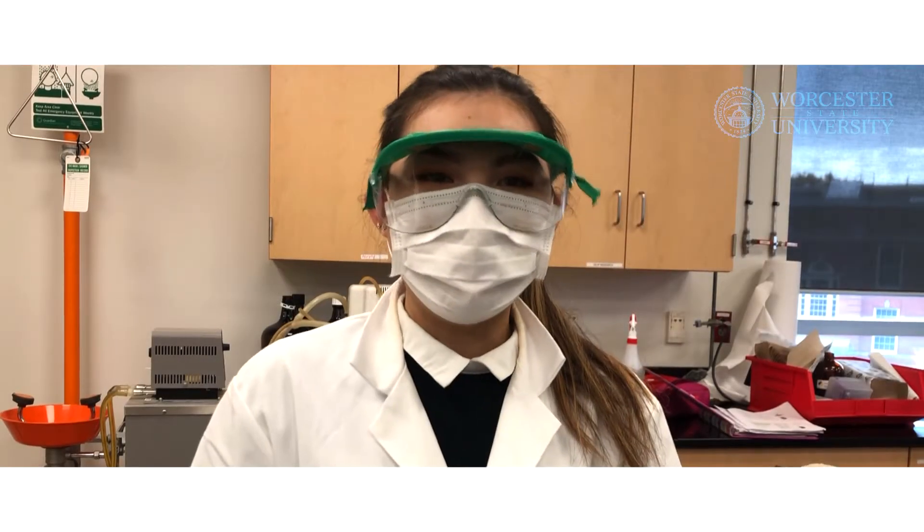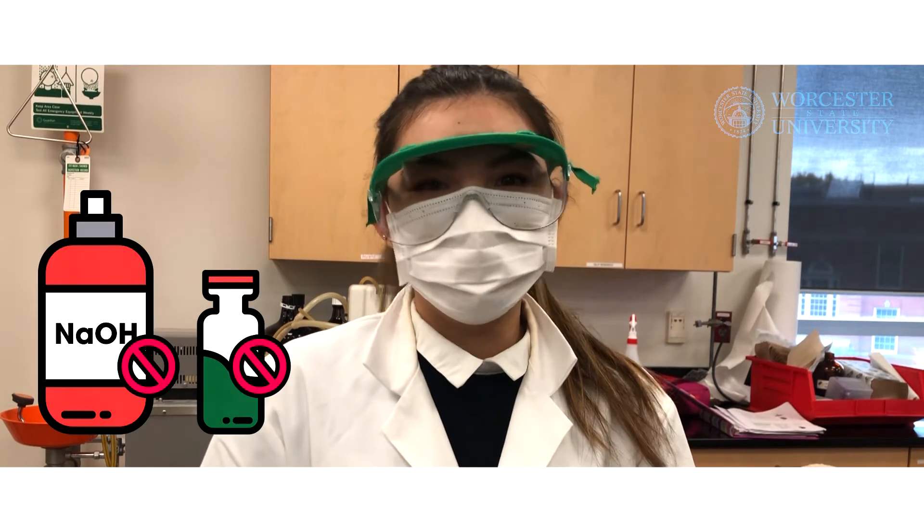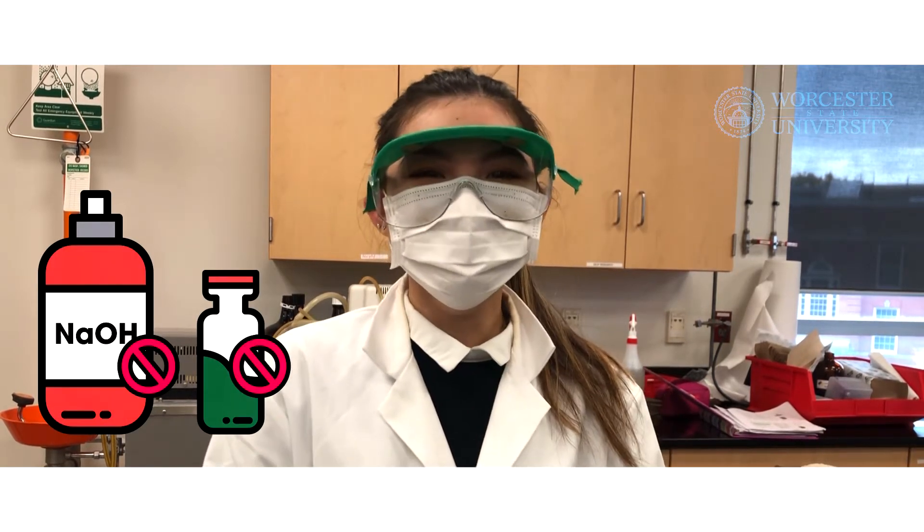Before we start, please make sure to wear your goggles, mask, and gloves. Also, take proper precautions so as to not come into direct contact with sodium hydroxide or the reaction mixture that you will make.